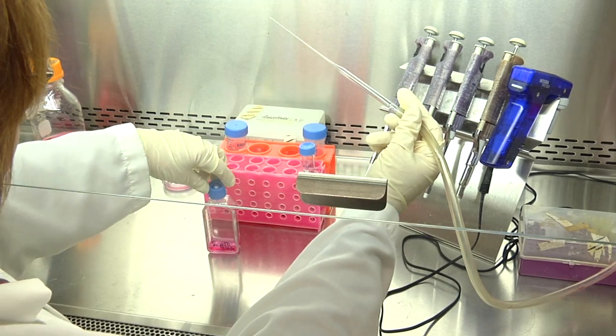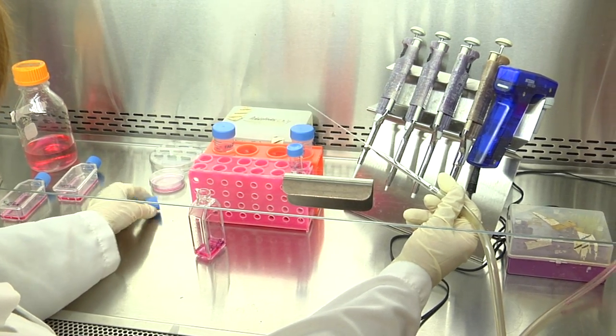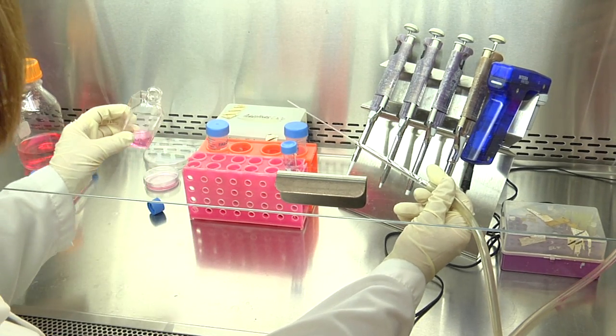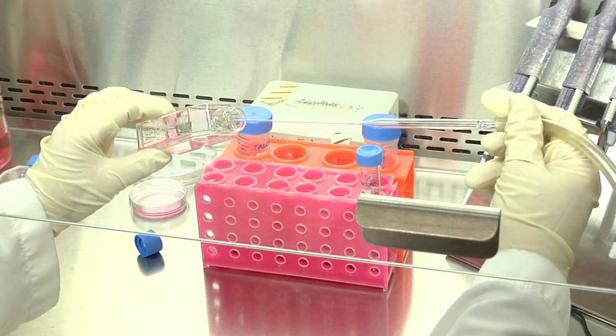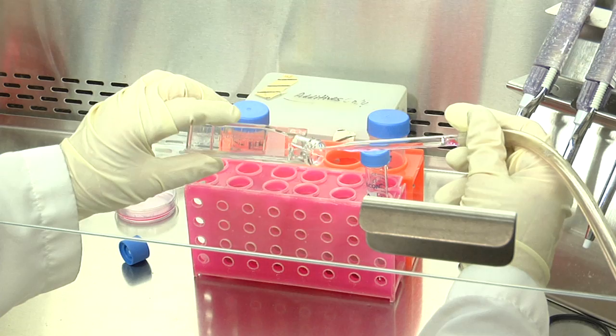Then remove the cap previously loosened, place it on its side, and aspirate the medium away from the surface where the cells are attached — as indicated by my finger tapping. The cells are on the top surface of the flask I'm holding, and the medium is against the surface that does not have the cells.